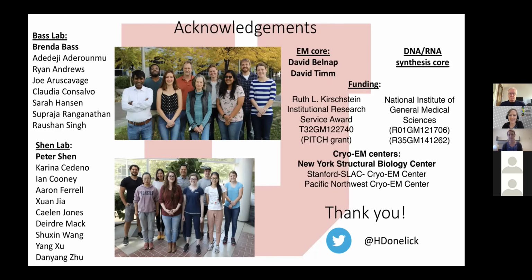All right, thanks. Then does your structure have a uniform estimated resolution, or even at low resolution, do you find that there are regions that are significantly better than others? Yeah, so I was trying to run local resolution before I presented this, but I just ran out of time. But if I lower the threshold whenever I'm looking in Chimera, there are regions that have higher resolution, specifically in the RNase 3 domains. That seems to be pretty stable, but the rest of the protein is still fairly flexible.